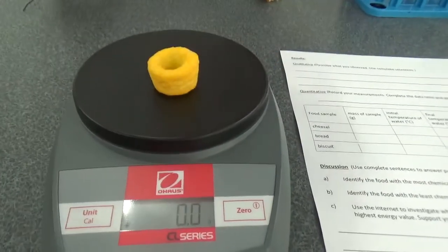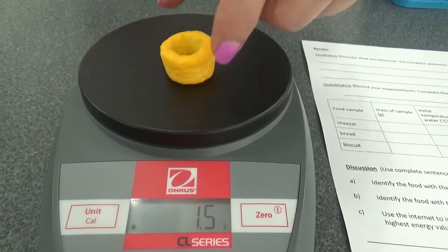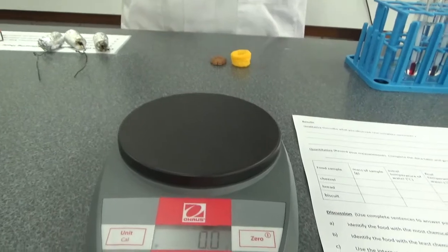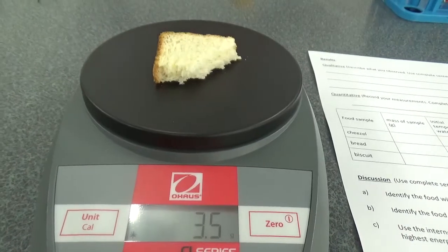Let's weigh this cheezel. On the balance — 1.5 grams of cheezel. I could eat a lot more cheezel than that. Next, the stale bread. You can eat this one. The stale bread weighs 3.5 grams.